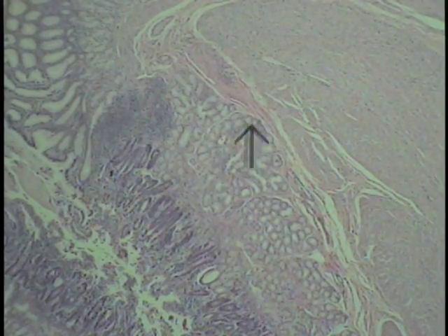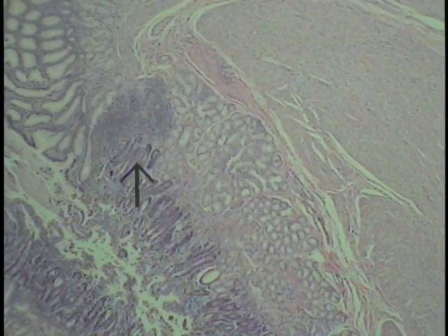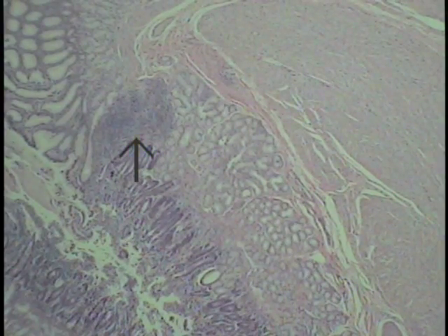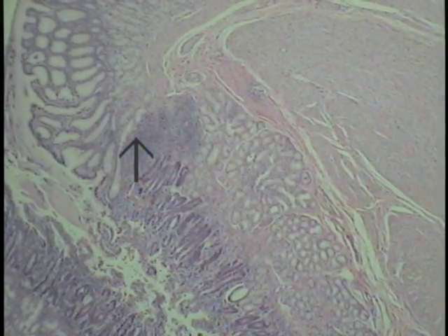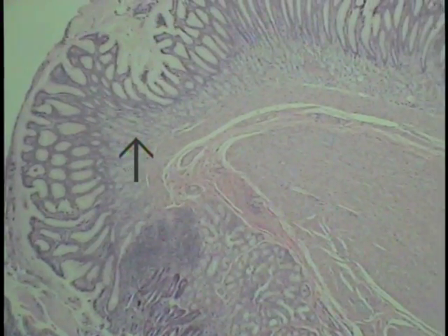So they're beneath, or on the muscularis externa side of, the muscularis mucosa. And here are the Brunner's glands here. This little lymphatic nodule can be quite well developed in individuals. In earlier literature, it was given the term duodenal tonsil because it is found relatively frequently, and I think it's estimated about 45 or 50% of the population will show a large lymphatic nodule at this very abrupt junction of the epithelia.